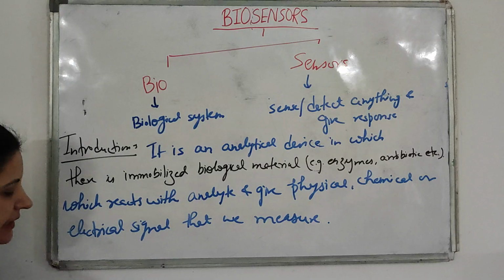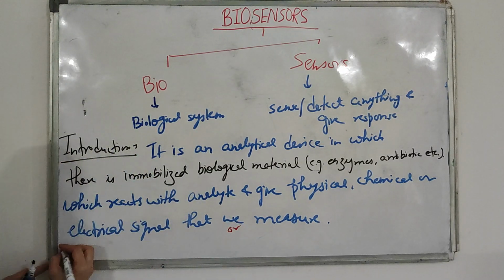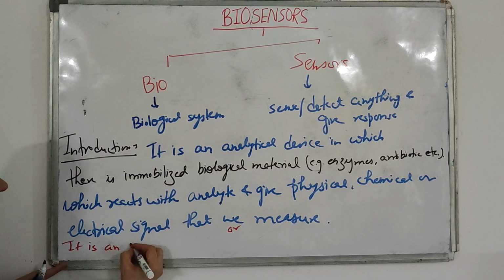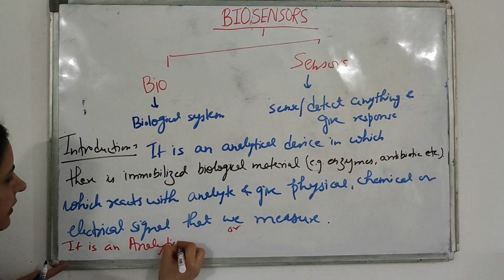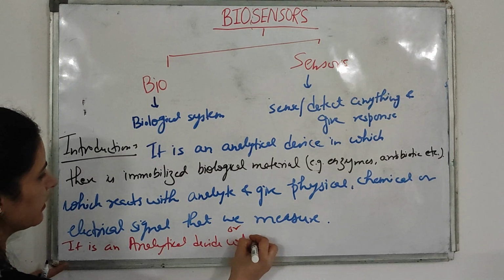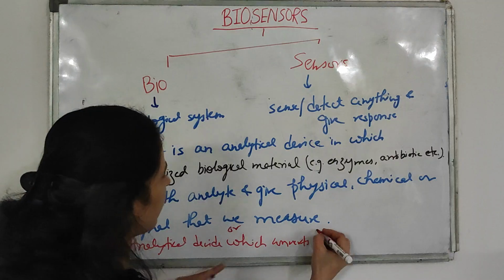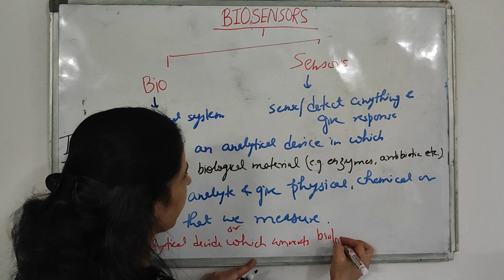Or in simple terms, if you want to write a simplified definition, you can write: it is an analytical device which converts a biological signal to an electrical signal.